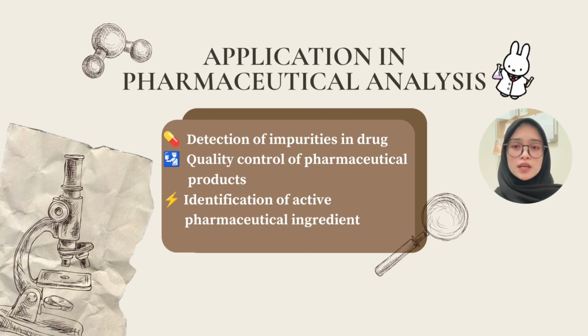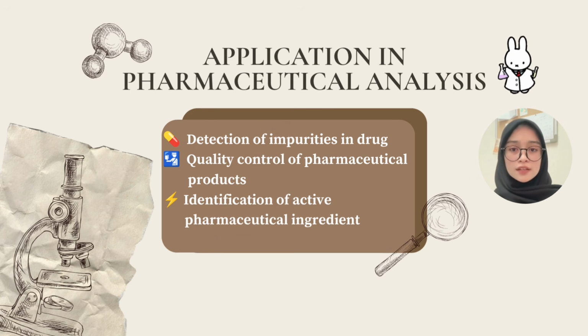Moving on to the applications in pharmaceutical analysis. As listed on the slide, there are 3 main applications. First, the detection of impurities in drugs. Second, the quality control of pharmaceutical products. And third, the identification of active pharmaceutical ingredients. That concludes the applications for this part.